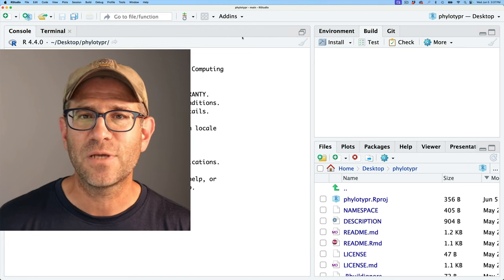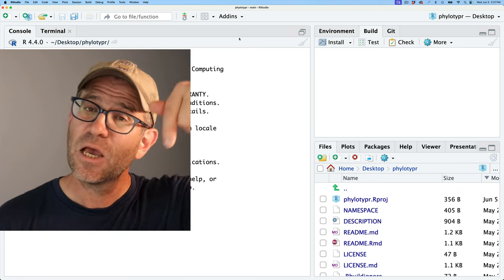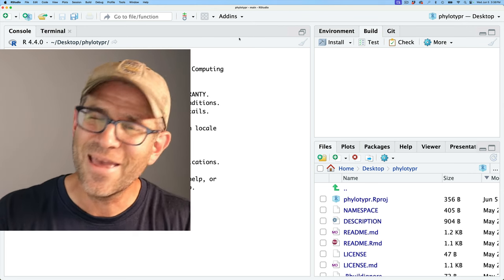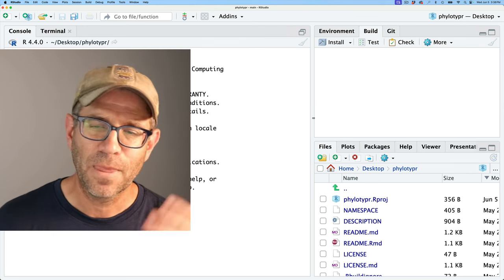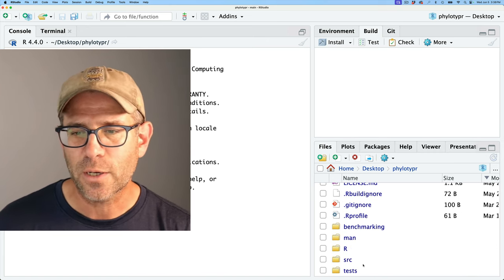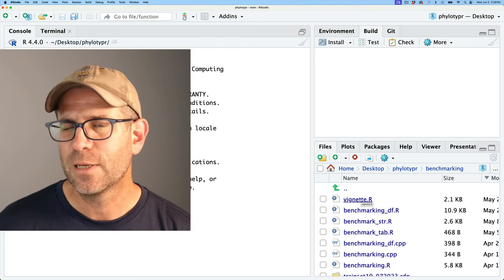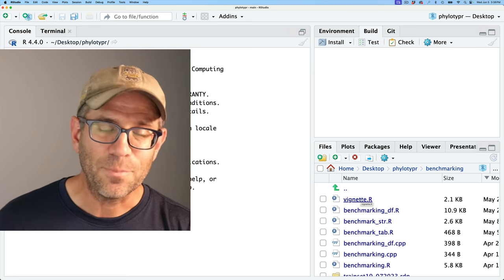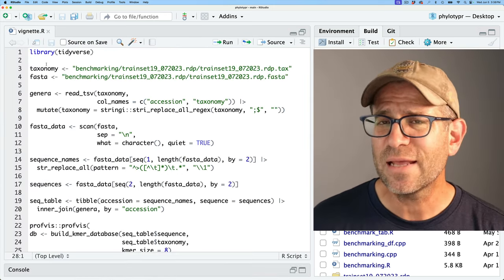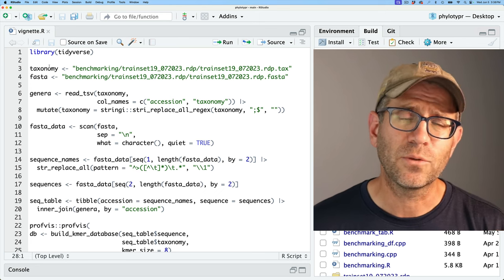Over here in RStudio, I have my phylotyper package opened up with all the code. If you want to get the repository as it currently stands, go down below in the show notes and you'll see a link to GitHub for what the repository looks like right now, as well as what it looks like at the end of the episode. Here we are in the home directory for our project — the project root directory — and there's a directory called benchmarking where I have my vignette.r script.